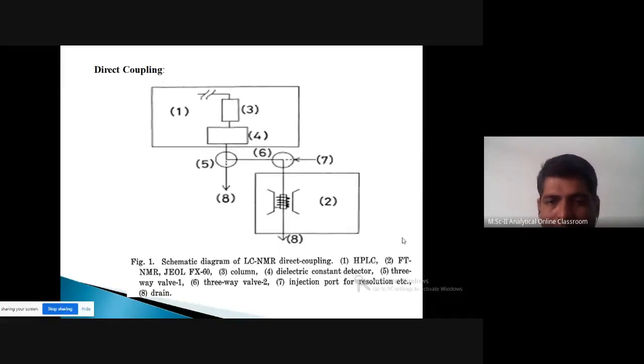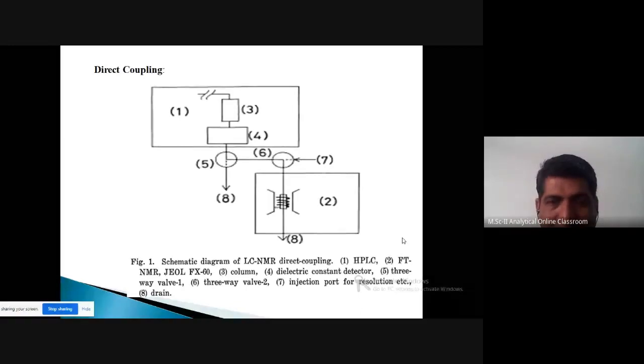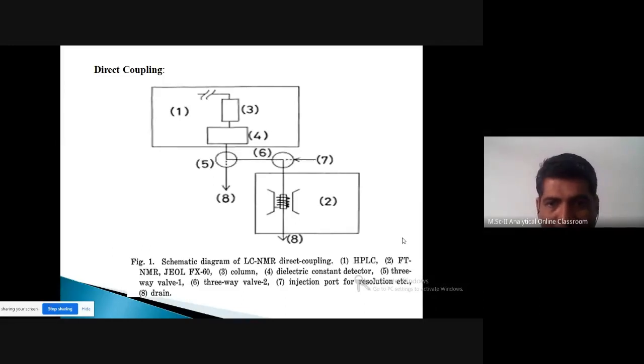बिकॉज एनएमआर इज टेक्निक फॉर द हायड्रोजन इंटरप्रिटेशन, बरोबर? मग जर बेंझिन मध्ये 6 हायड्रोजन असतील तर आपण स्टँडर्ड म्हणून वापरू शकतो का? वी कांट, बिकॉज इट विल इंटरफेअर विथ युअर सॅम्पल. सो इफ यू वॉन्ट टू यूज बेंझिन, देन यू हॅव टू रिप्लेस हायड्रोजन बाय द ड्युटेरियम ऍटम. ओके, म्हणजे C6D6. D म्हणजे हायड्रोजनचाच आयसोटोप. आयसोटोप माहित आहेत ना तुम्हाला? हायड्रोजन, ड्युटेरियम आणि ट्रिटियम. सो वेन यू रिप्लेस हायड्रोजन ऑफ बेंझिन बाय ड्युटेरियम, देन इट कॅन ऍक्ट ऍज अ सॉल्व्हंट.